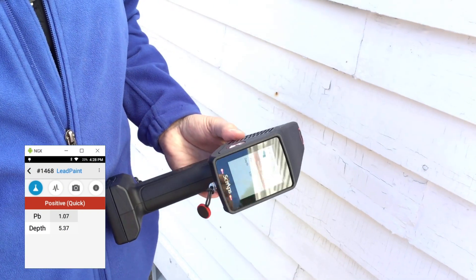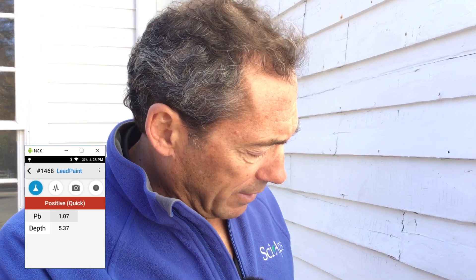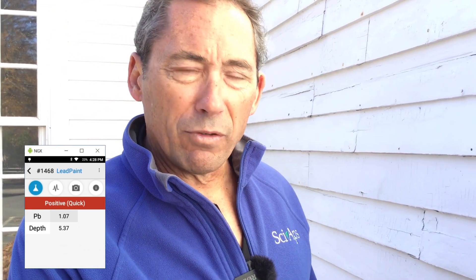That test was probably five to six seconds. The reason it was that long was because the lead is so close to the action level — you need really good precision to make sure it's above or below one. And as you know with XRF guns, the longer you test, the better the precision.